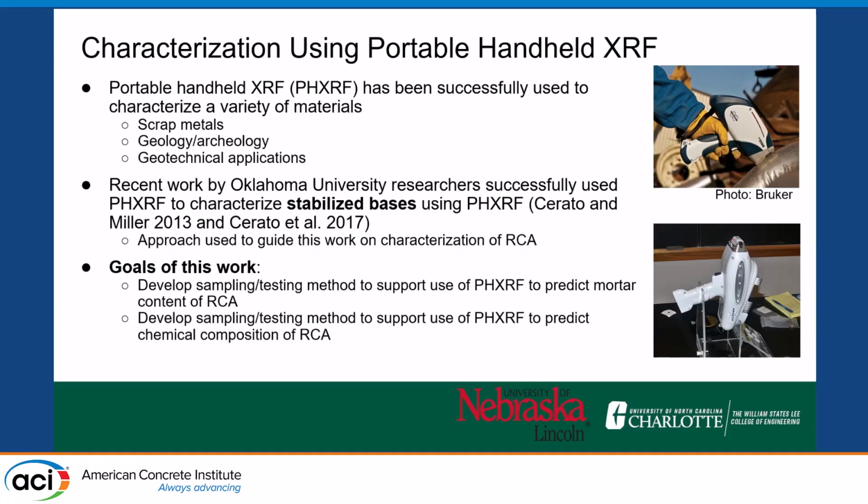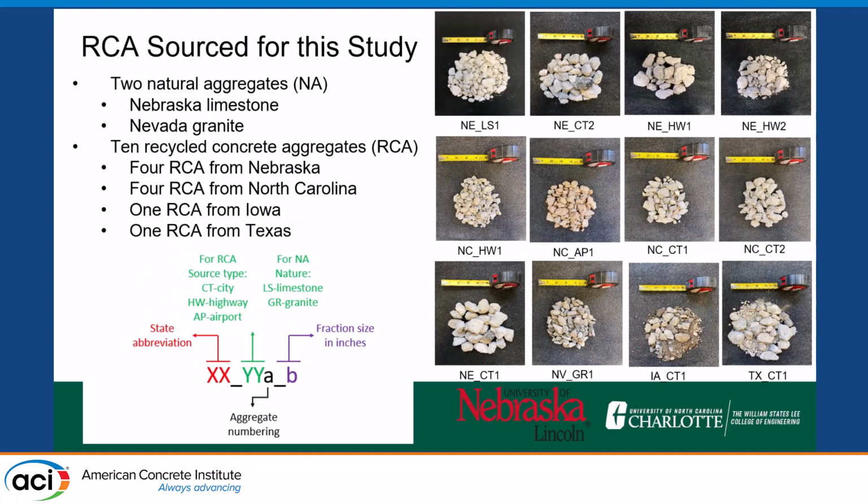The scrapyard use, he's sort of pointing and shooting. Obviously, the downside of that is that it's a little bit safer to have it in benchtop mode, because you can cover the beam and your user is isolated from it. It's a safer application than point and shoot. So we use the benchtop approach.